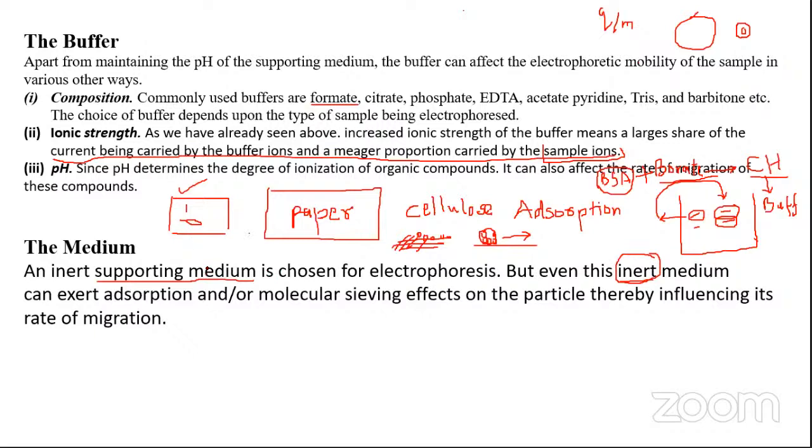Obviously not, but imagine that this can work better for you only if the molecules that you're separating are far different from each other. Like you were getting two bands this separate in the usual situation. So if it is dragged during electrophoresis, you will get two bands like this. Rather than bands, you will get spots. However, if two molecules are very similar to each other, and differ by just a minor value, then separation by doing paper electrophoresis will be useless. Are you getting the point?